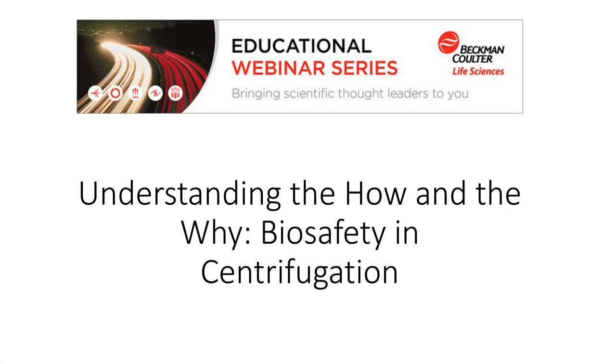We have a manual that has really not changed much for a while that we call our Rotor and Tubes User Guide. And we can certainly send it to anybody who's interested in it. It's a good overview of all the different techniques, all the different types of rotors.